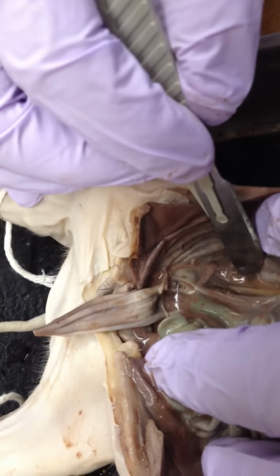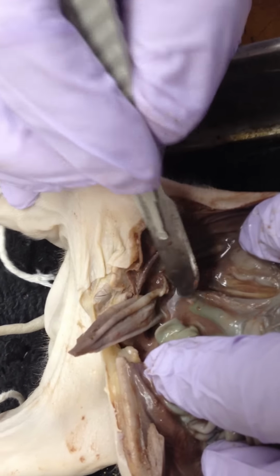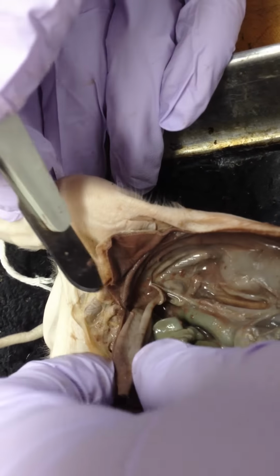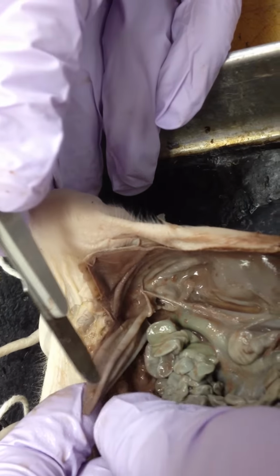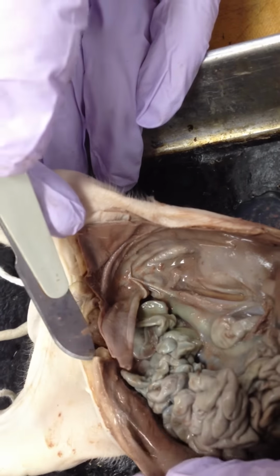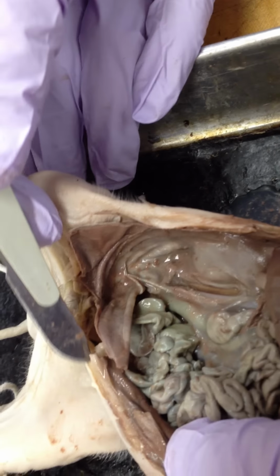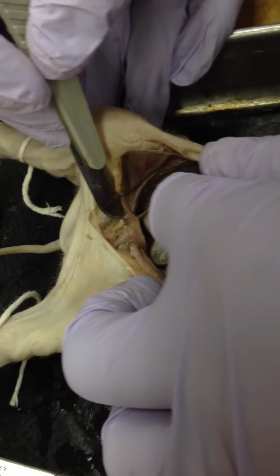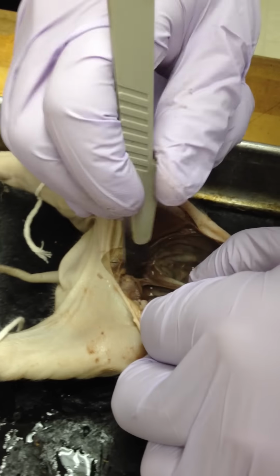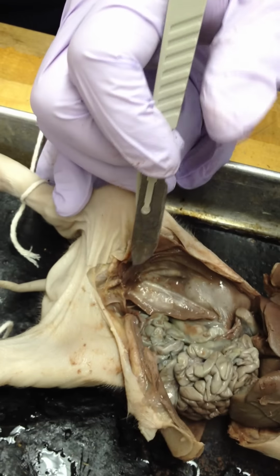There's the ureter, and there's the bladder down here. And there's the urethra, I think. This must have been the urethra right here, and it comes out. You see this big thing right there? And it goes through here. Let me just see something here. How big is this bladder? Can you give me forceps?